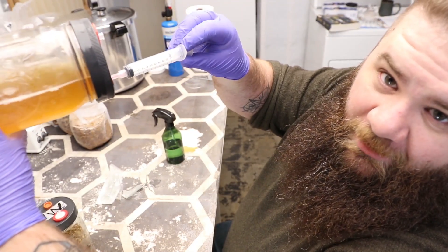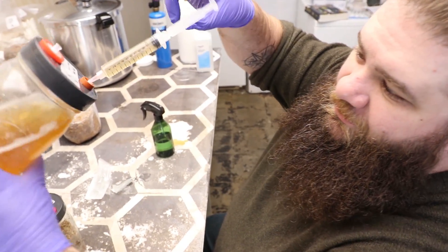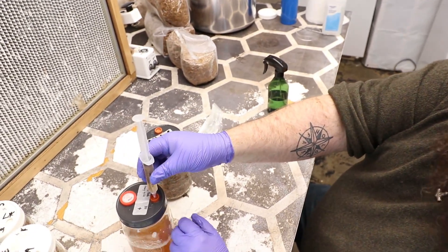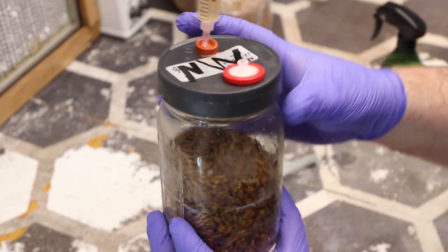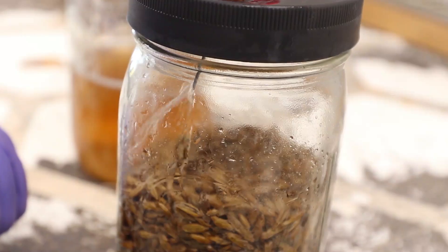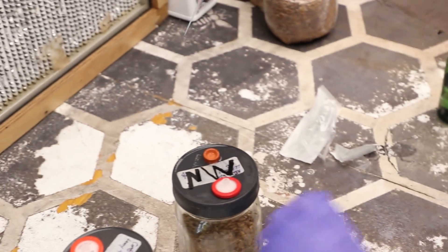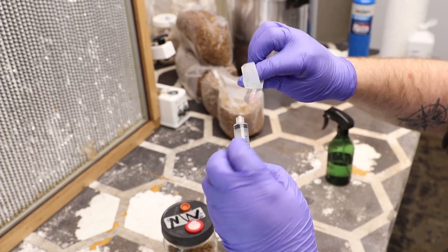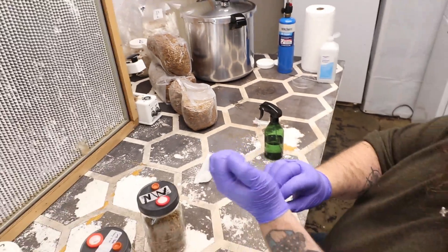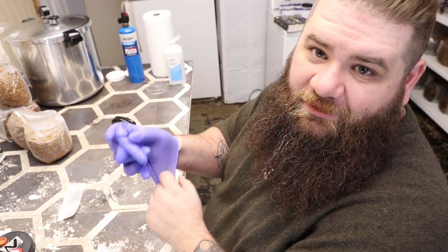Sometimes if your syringe doesn't look like it's got enough in there, you can inject it back, let it really stir up everything in the jar, and then suck it back up — you should have a lot more mycelium in there instead of just liquid. So now that I've got my mycelium, I'm going to just stab it into the jar and do the twist. After that, take care of your sharps. We've got a little sharps container sitting just outside the lab. I always wrap my syringes up in my glove, because I always change gloves between sets.